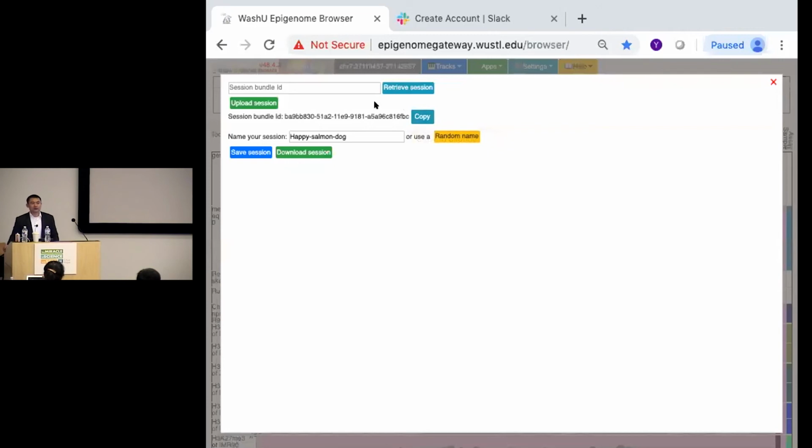That's a good question. We can fetch sequence. I think we can get the slice of data. I don't remember how to do that because the data, we access the data, so you can get the data as a table. The format is just whatever you see is whatever you get. So it's the table of numbers.